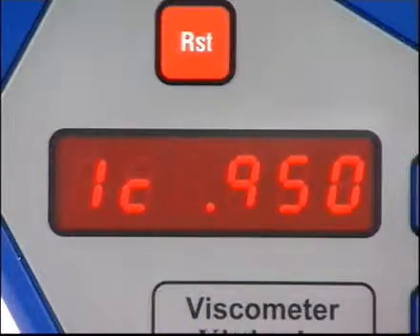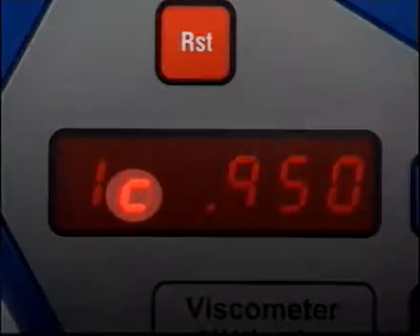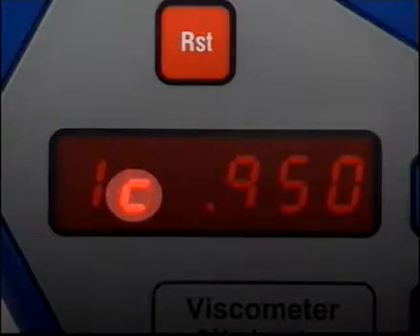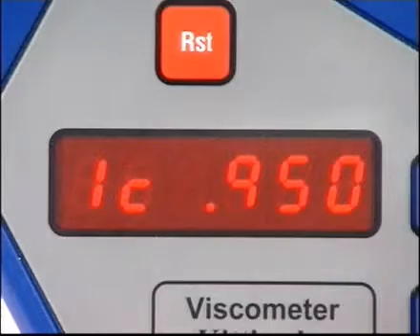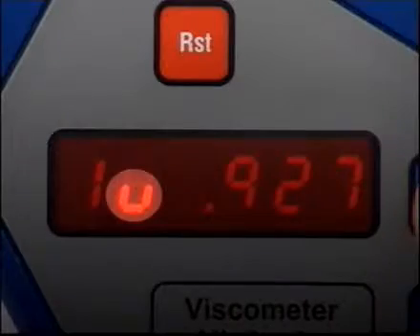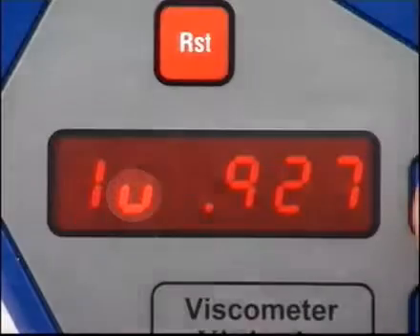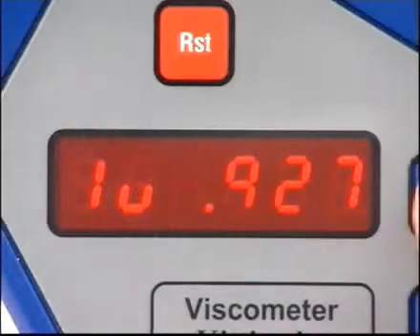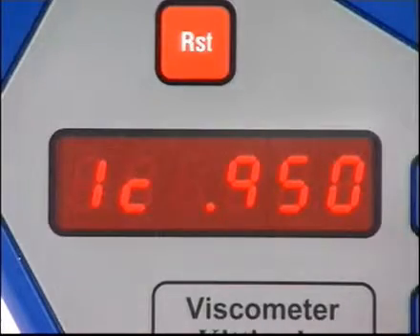In Mode 1, the small c indicates a corrected reading at 15 degrees Celsius in vacuo. If you were given a reading at 50 degrees Celsius in air, correct this by pressing Return and entering your uncorrected reading. Press Return again to obtain the corrected readout at 15 degrees in vacuo.